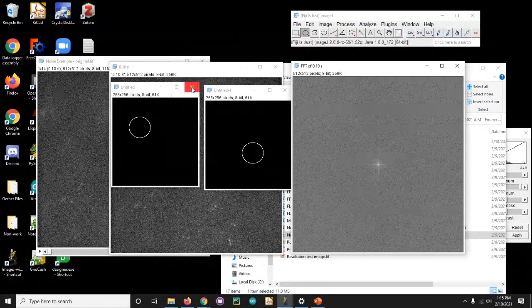Close that. Close that. Okay, so here's our image. So this is where image processing becomes a fun little strategy game, because we have a bunch of different things going on. So it just becomes a game of how can I define what I don't want and get rid of it from what I do want. And so looking at my image, one of the first things that really stands out to me is I have this sort of weird wavy ripple pattern.